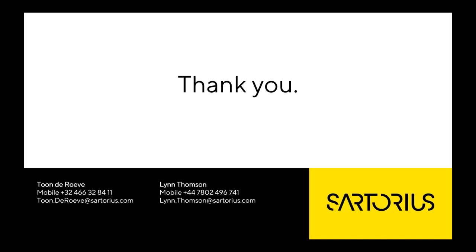And a last question was if this software can be used with adherent cells only, or if they can also use suspension cells. And the answer is yes, you can use it with both cell types, adherent and non-adherent. We have examples on our website, and we showed some examples on the webinar. So if you also need more information on how to set up these assays, you can contact your field application scientist. Thank you very much.